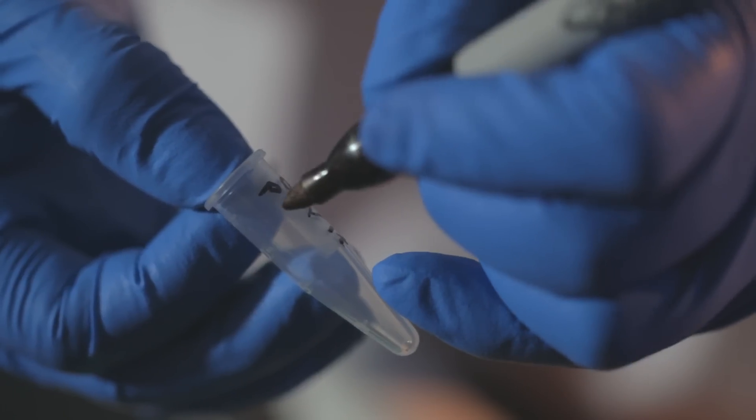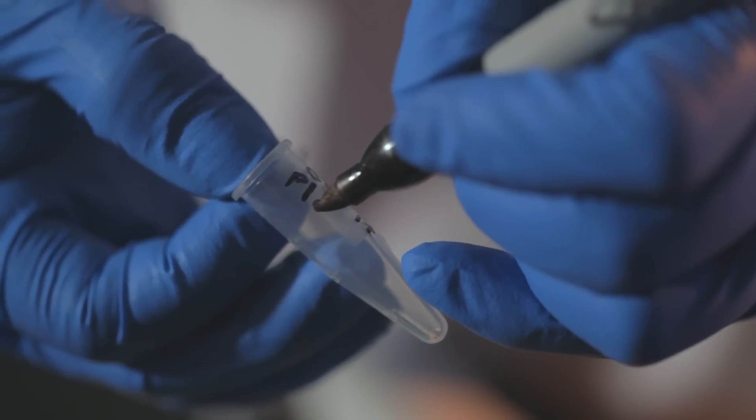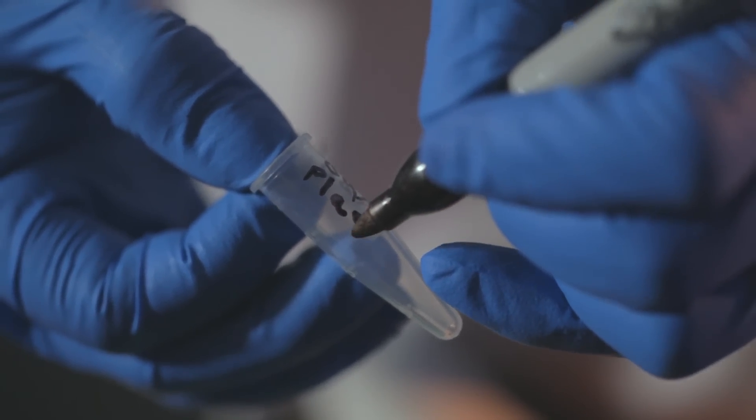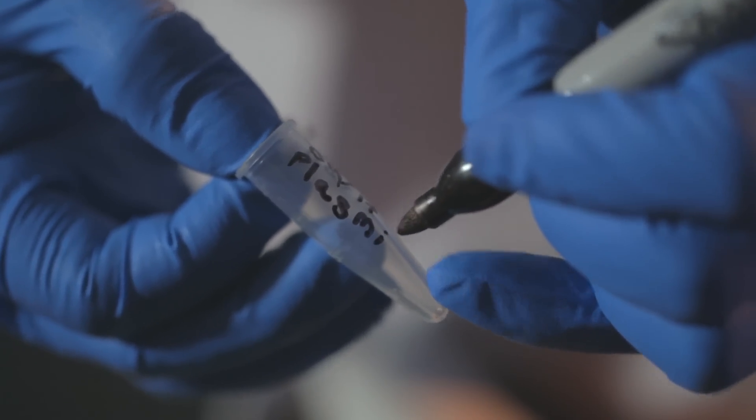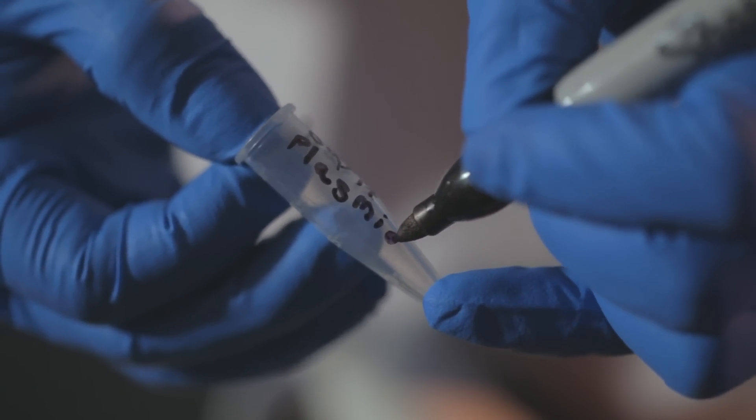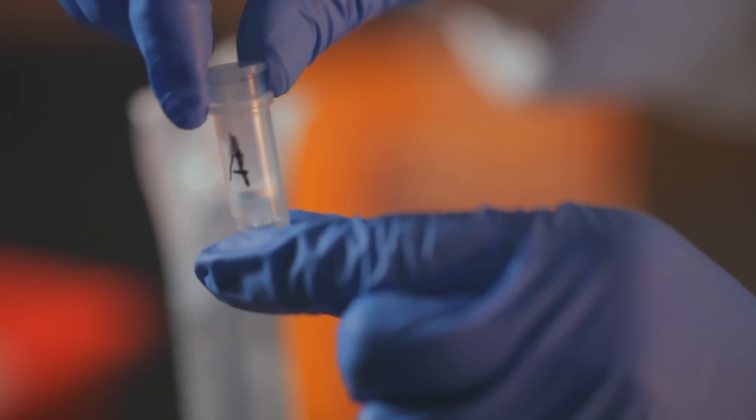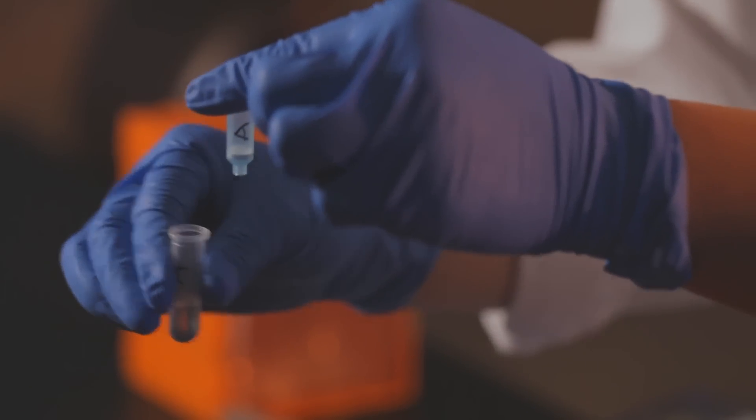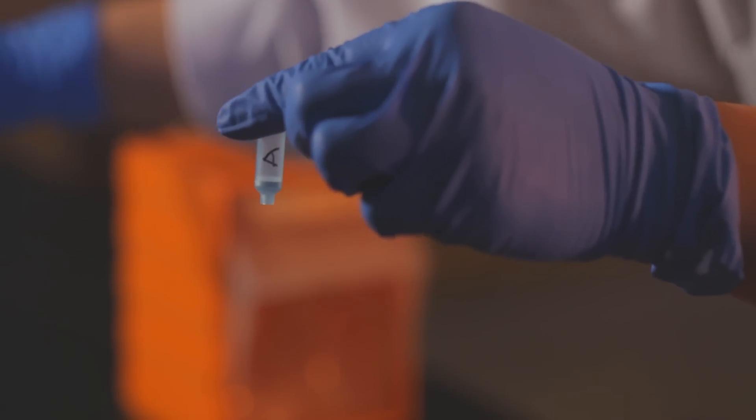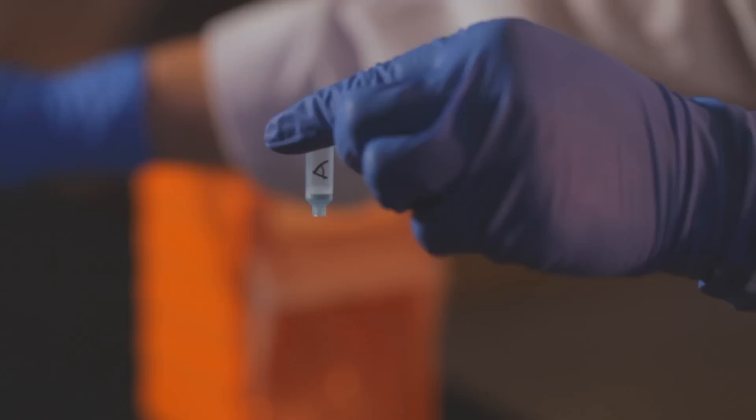During the spin, label clean 1.5 milliliter microfuge tubes to hold your final purified plasmid DNA. Be sure to include your initials and the date. Once the spin is done, remove the spin column and collecting tube from the centrifuge. Dump out the flow-through that is now in the collecting tube and place the column back in the collecting tube.